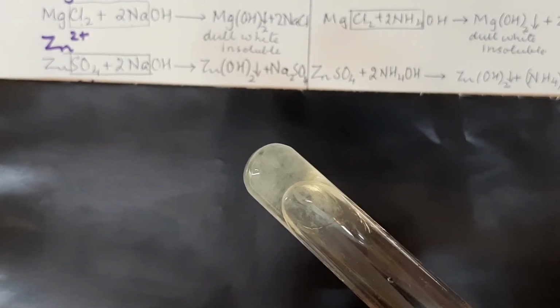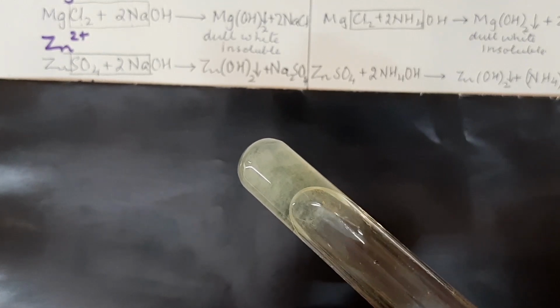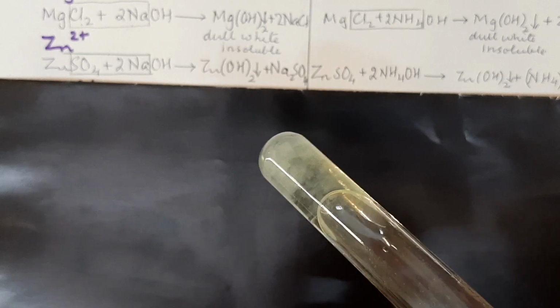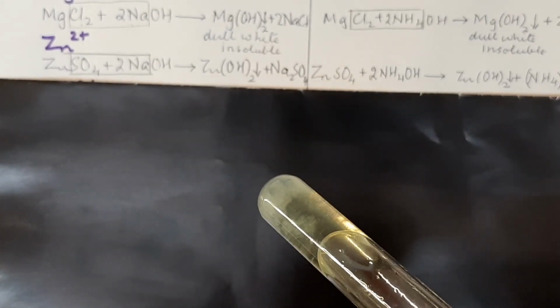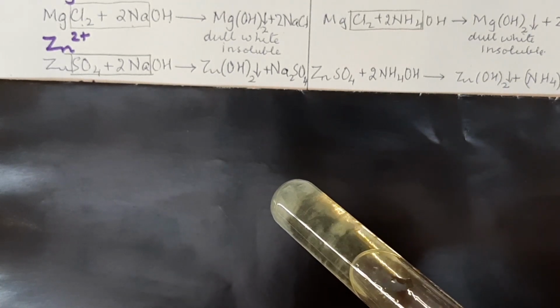It will dissolve almost immediately. That's a gelatinous white precipitate, and you can see it's becoming a clearer solution. I'll add a little extra.